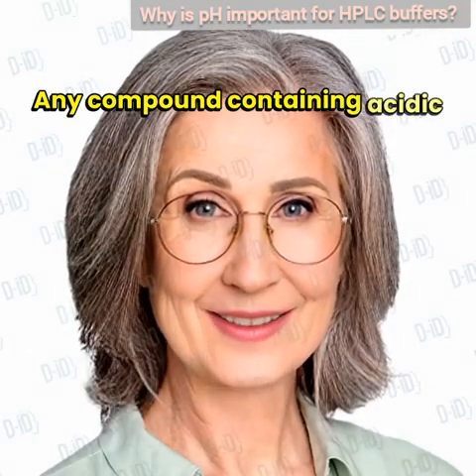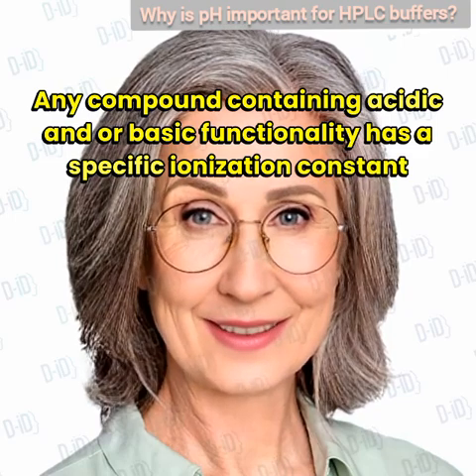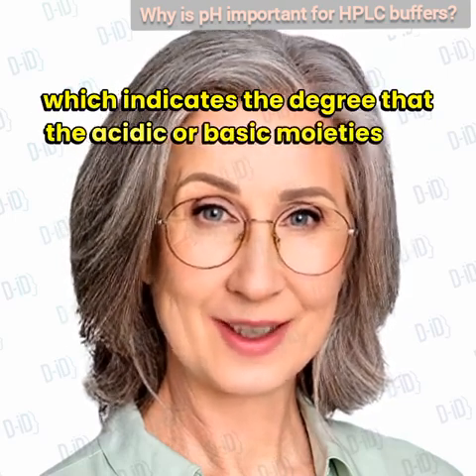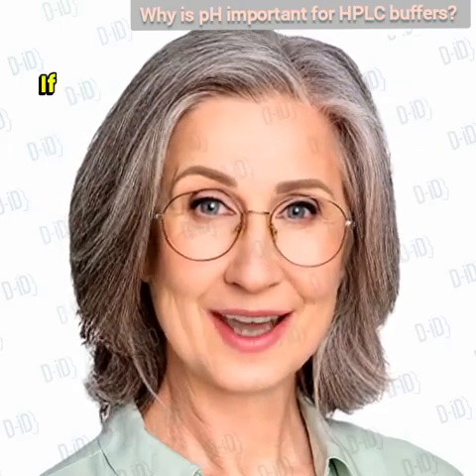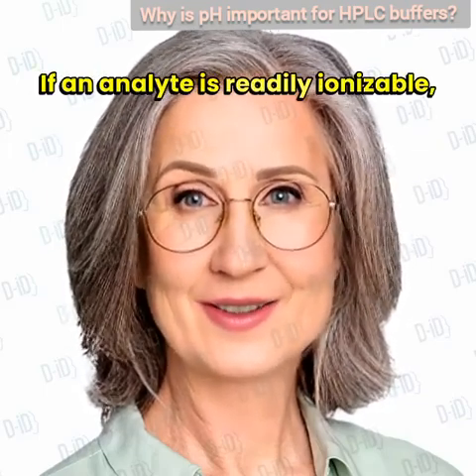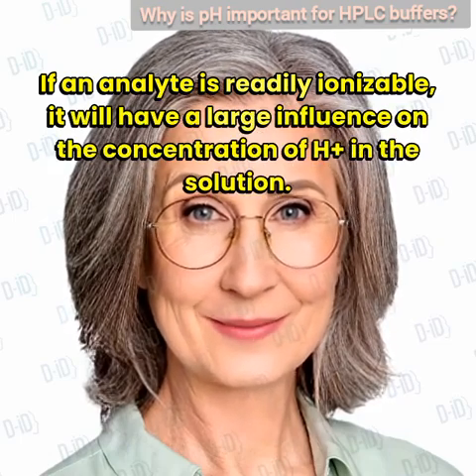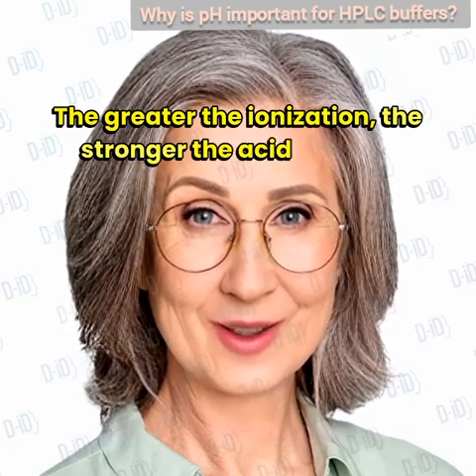Any compound containing acidic and/or basic functionality has a specific ionization constant, or Ka, which indicates the degree that the acidic or basic moieties will ionize in an aqueous solution. If an analyte is readily ionizable, it will have a large influence on the concentration of H+ in the solution. The greater the ionization, the stronger the acid or base.